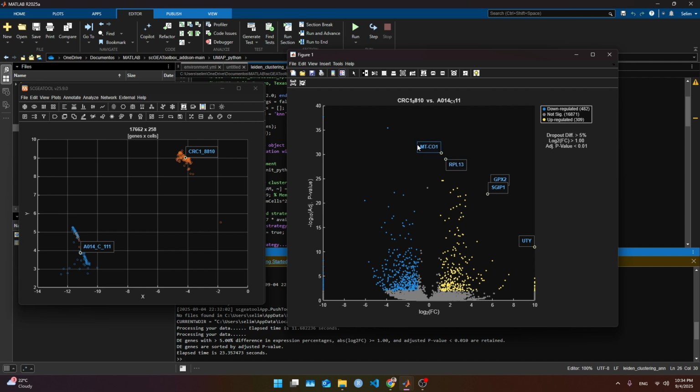This mitochondrial might not be good. We can just be cautious when those genes come out. But there might be some other good genes. And so forth, all these are important, but sometimes there are too many. In the downregulation also something can happen, and we are not aware of what. So we have to investigate as well what's happening.